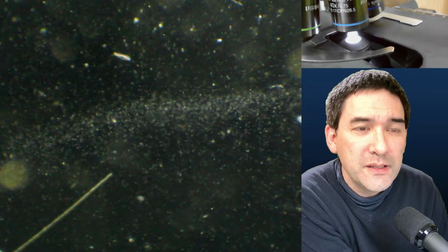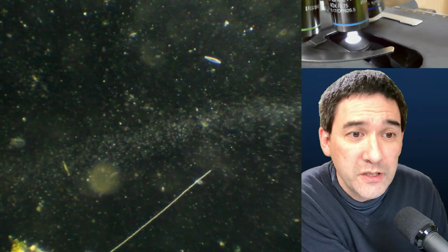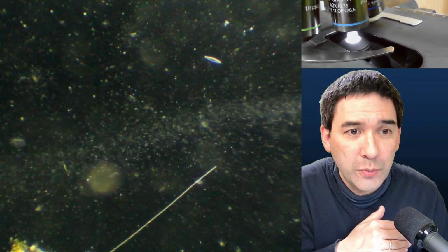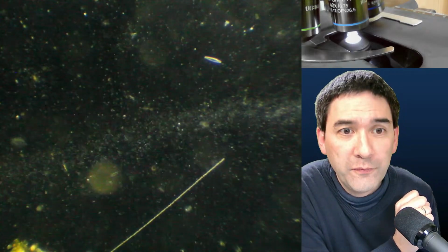And this is now basically again the front of the bacteria, which should be slowly moving in one direction. Sometimes in time lapse you can actually see this quite well. So this illustrates a little bit the following. I'm going to show you. I'm going to now remove the filter.